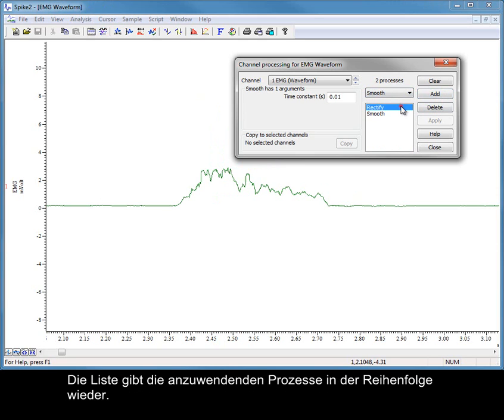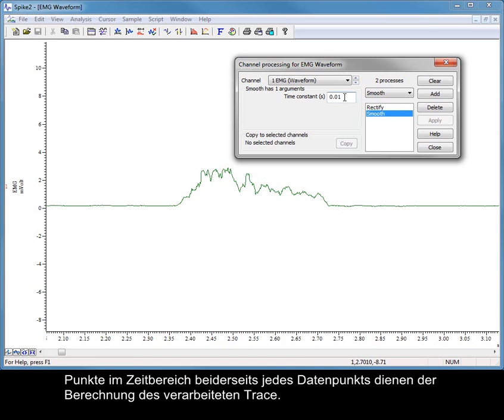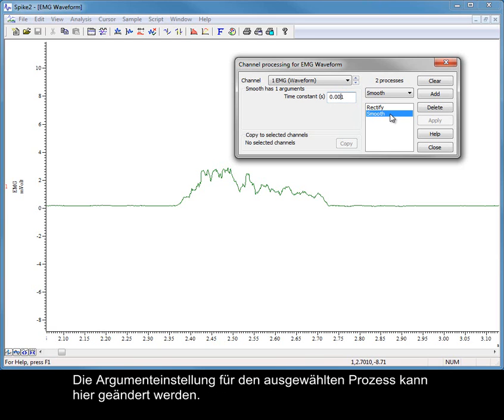The list shows the processes that will be applied in order. Many of the processes, like smooth, use arguments such as a time value. Points within the time range either side of each data point are used to calculate the process trace. Argument settings for the selected process can be changed here.